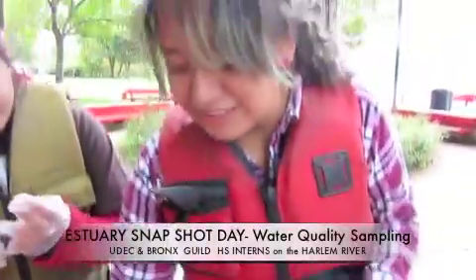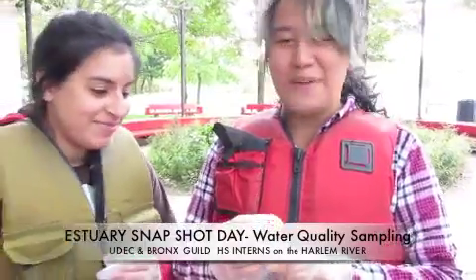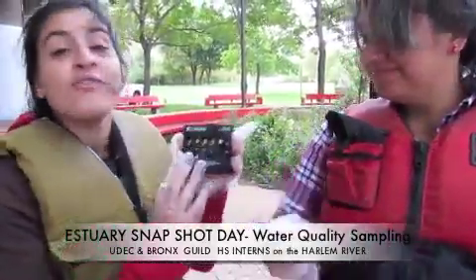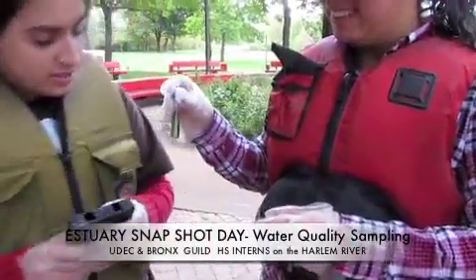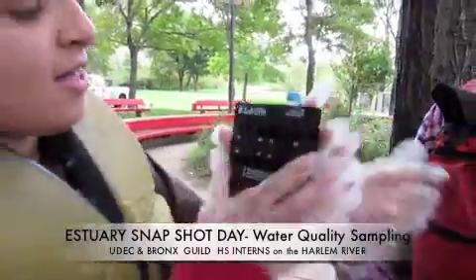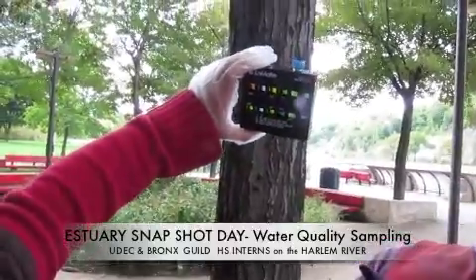Now we're gonna cover it and shake it from side to side, like scientists. And depending on the color, we'll see how much acid or the pH level in the water. We're gonna compare it to this colorimeter after a few seconds. It's done. We apply it into the plot, and then we put it up to the light, and we determine how much it is.